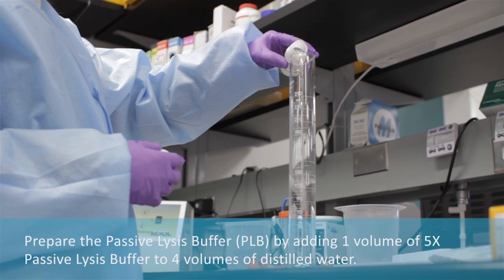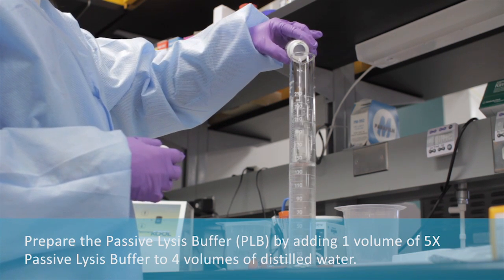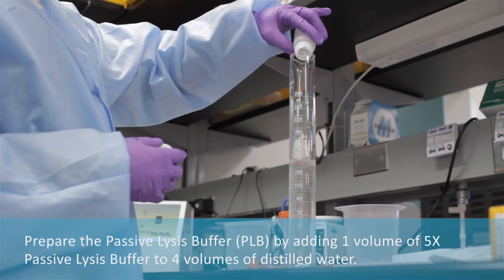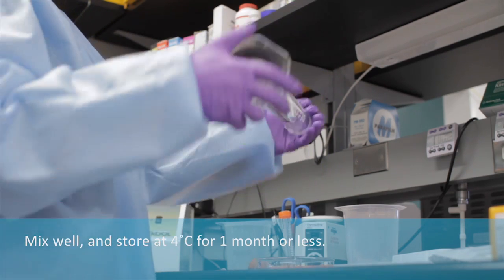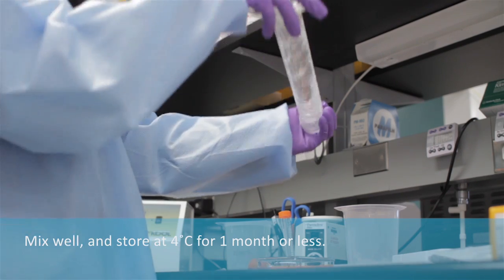Prepare the passive lysis buffer by adding one volume of 5X passive lysis buffer to four volumes of distilled water. Mix well and store at four degrees Celsius for up to but no longer than one month.